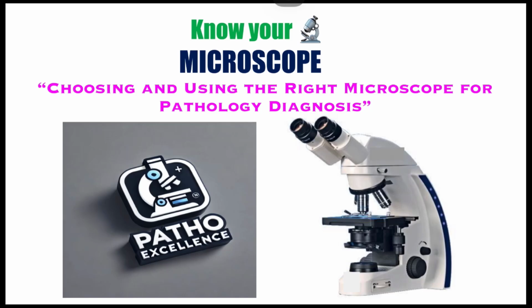Do you know your microscope, or do you know how to choose and use the right microscope for pathology diagnosis? If the answer is no, then this is a video you must watch before buying or using any microscope. You all know every pathology diagnosis begins with one instrument, the microscope. Yet, most students learn pathology without truly understanding it.